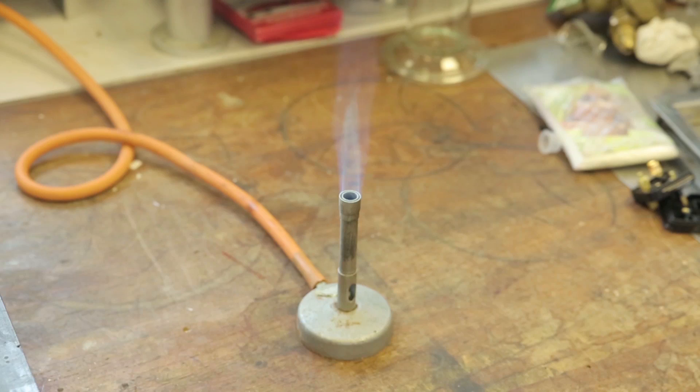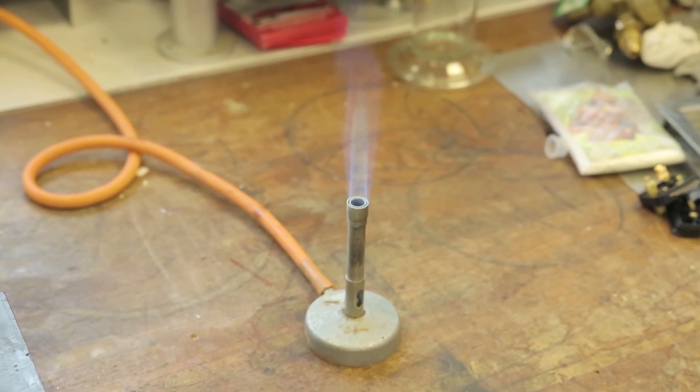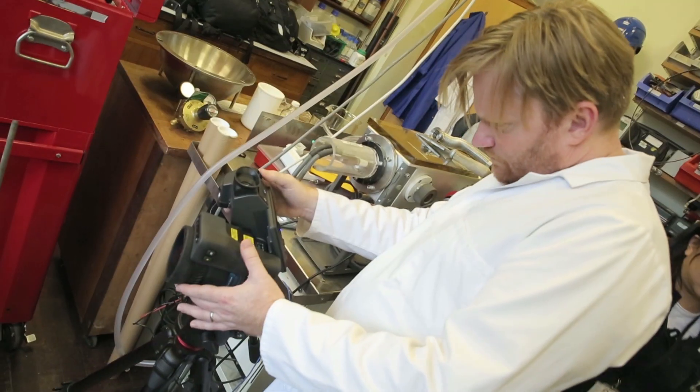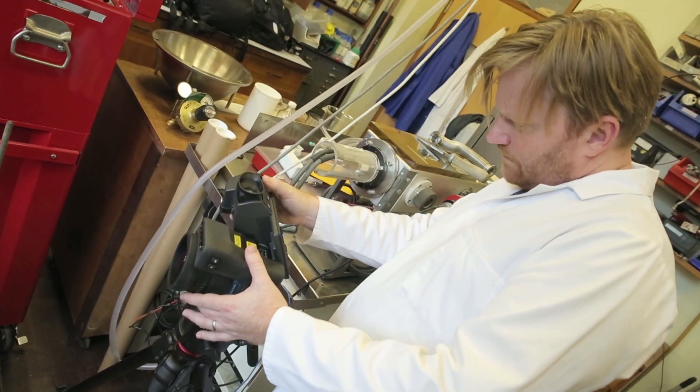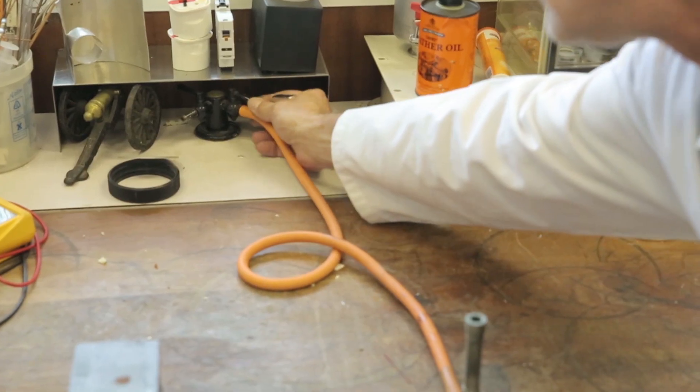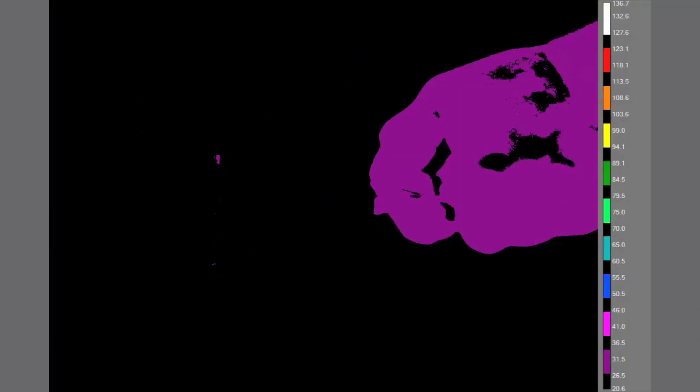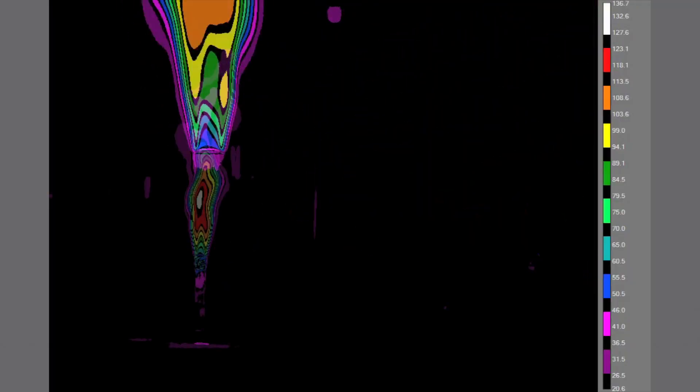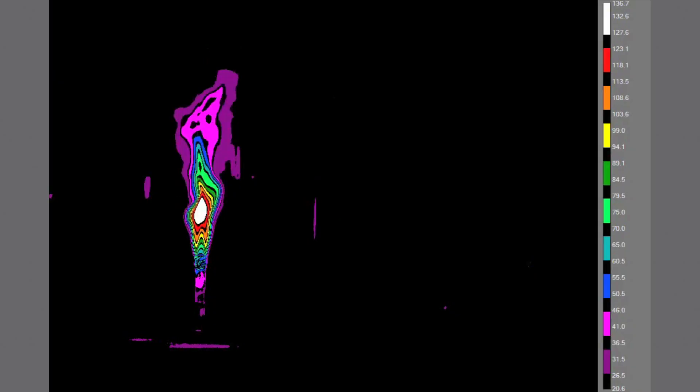If you look at a flame, you can see different parts are different colors. But most people just have to take their teacher or professor's word that some bits of the flame are hotter than others. With a thermal imaging camera, we can actually show you that this is true. And also, you can see more structure to the flame than you can with your eye.